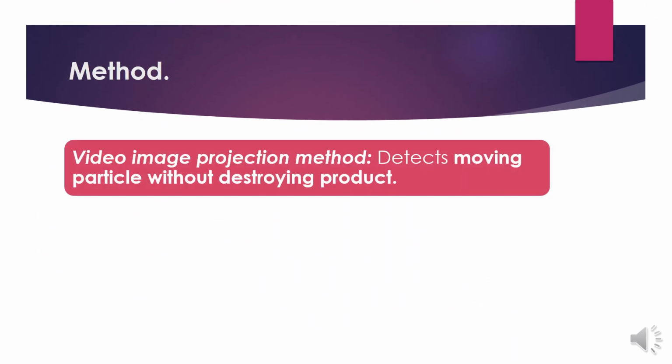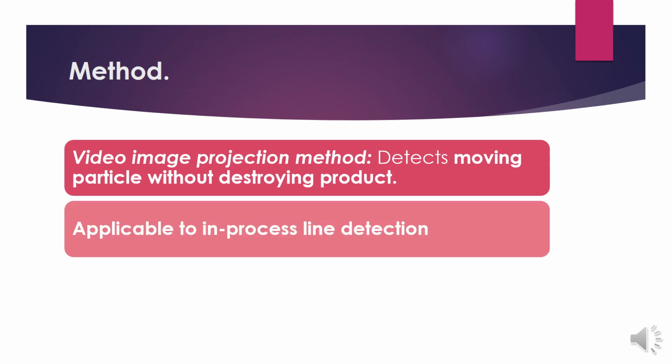So another method we have is the video image projection method that detects moving particles without destroying the product. This is one of the important factors here. The equipment that is applied for the detection is also not destroying your product and provides you valuable results.